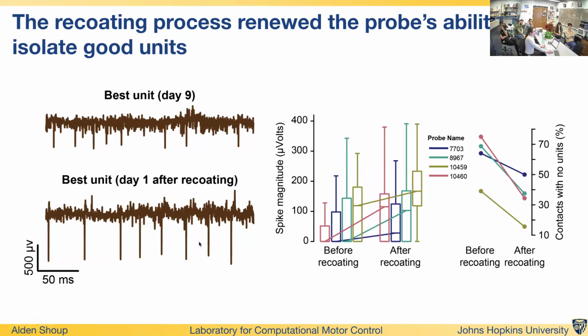And to be fair, your best unit and the number of units that you get are going to be somewhat dependent on where you are in the brain. And so you can't just rely on one day of before and after to tell you, are you getting a good effect? You definitely have to quantify it over more.